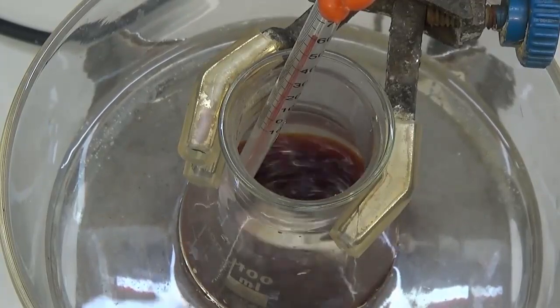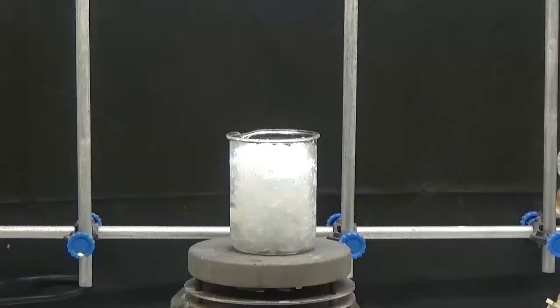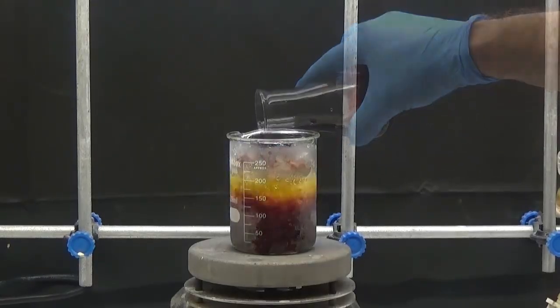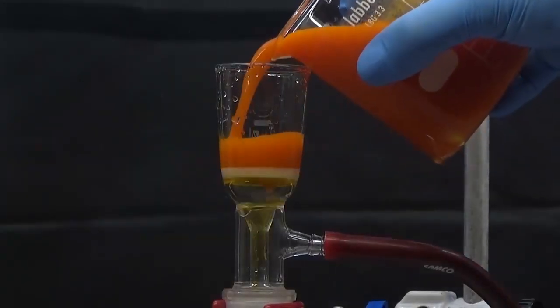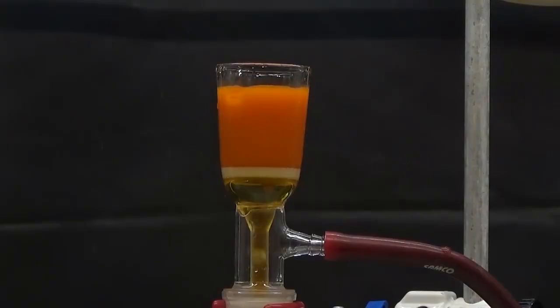Once all the isonitrosoacetanilide has been added, stir for 20 minutes and pour onto more than 150 grams of ice with heavy stirring. Wash the flask 2 times with a small amount of water. Stir for 30 minutes until an orange precipitate appears. Collect the precipitate by vacuum filtration and wash 2 times with a little icy water. Leave to dry in an oven at 80 C or in a desiccator.